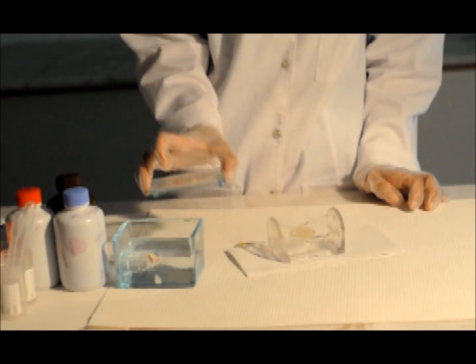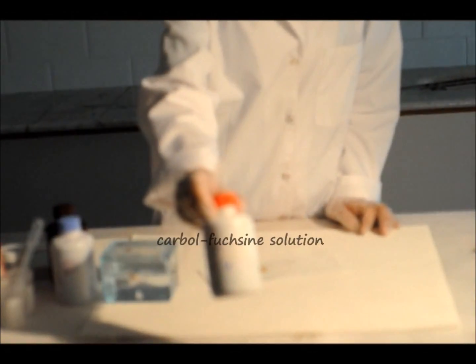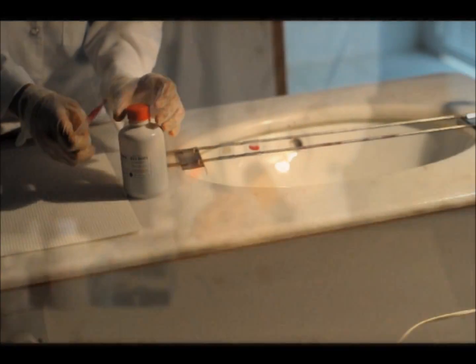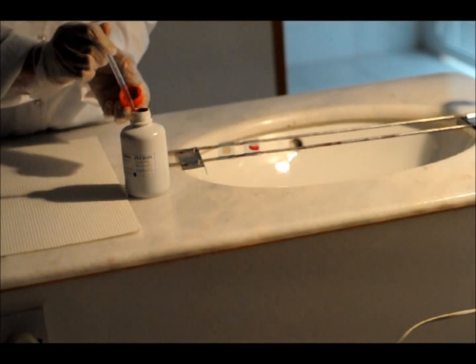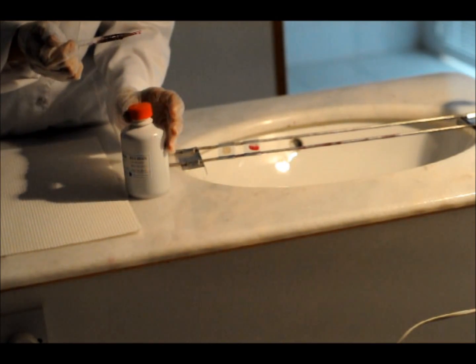After fixation, the smear is ready for staining. Apply the dilute carbofuchsin solution for at least 15 minutes.